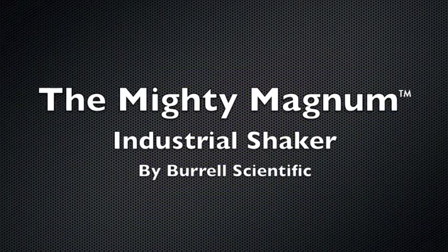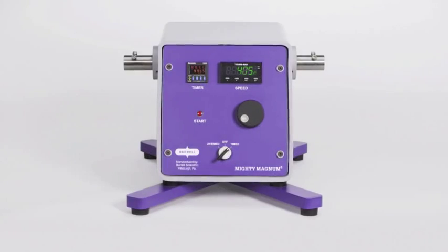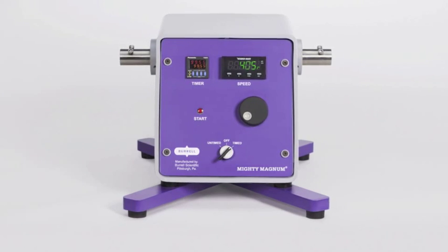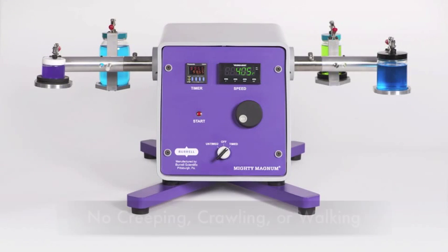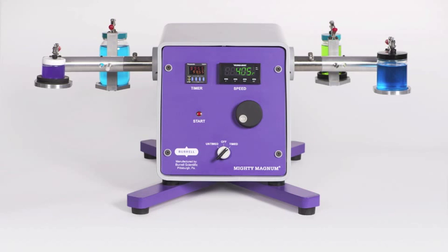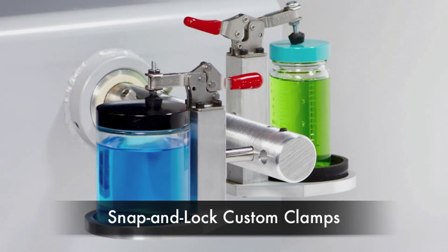The mighty Magnum industrial shaker by Burrell Scientific — the industrial shaker every lab has been waiting for. This heavy-duty shaker weighs in at over 140 pounds and can shake almost any size flask, bottle, or jar from 10 milliliter up to 3,000 milliliter.